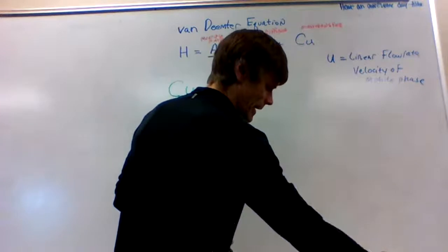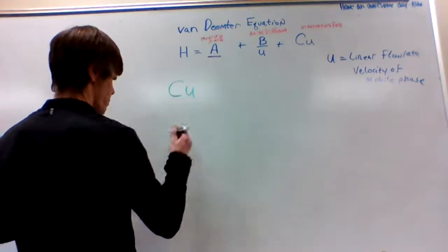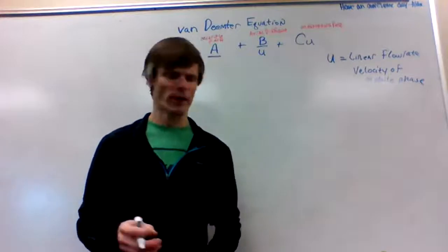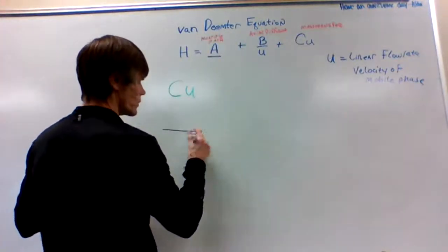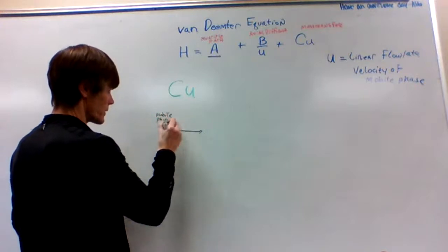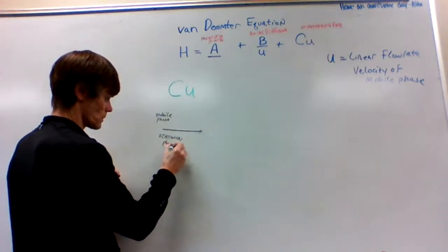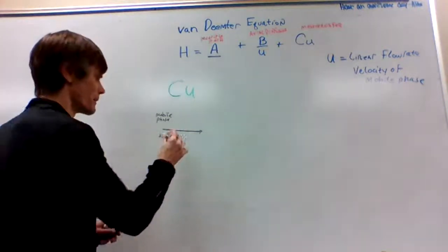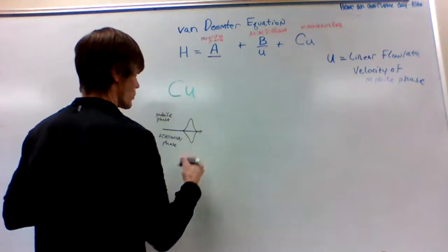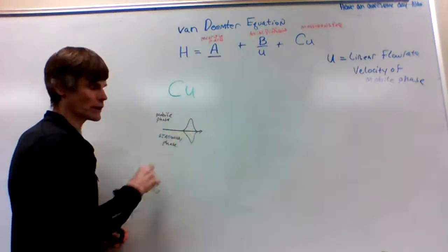So let's think about what's happening. And again, I have some images here. Let's look at a chromatogram. And we're not going to really look at a chromatogram. We're going to look at a flow profile. I think that's a better way to describe it. A flow profile. We're flowing in this direction with our mobile phase. So here's our mobile phase. And down here is our stationary support. It's sitting. It's not moving. And so what we get, we put a sample on there. We put it on as a plug, and it's nice, and it's not too broad. And we get an equilibrium that's occurring between sample in the mobile phase with sample in the stationary phase.